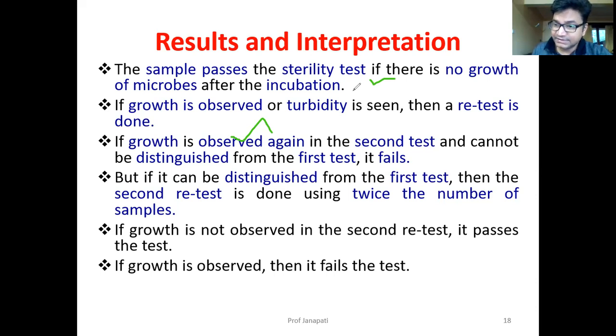Second, if it doesn't pass, you found some turbidity or some growth and you are not sure, then you repeat the test and compare with the old one.